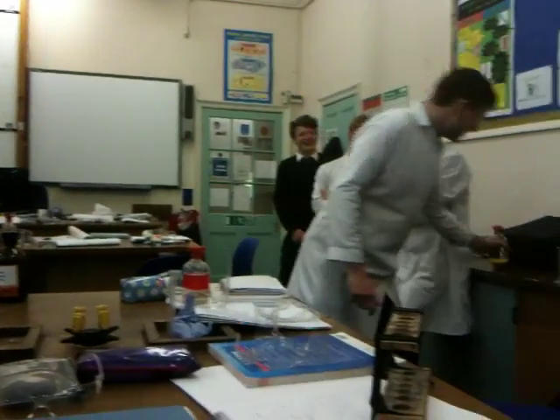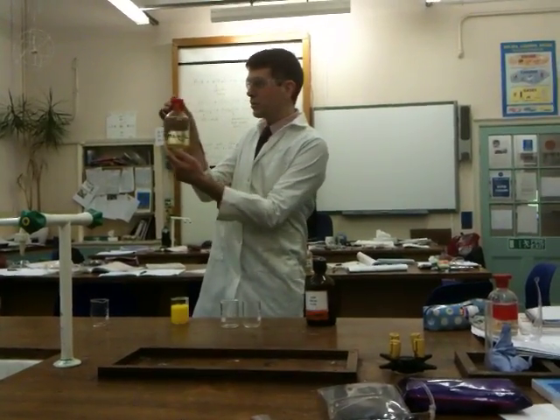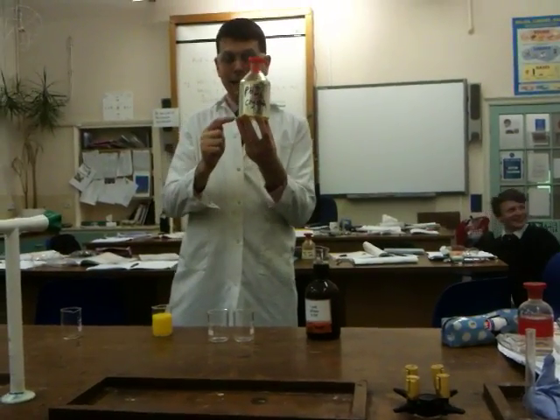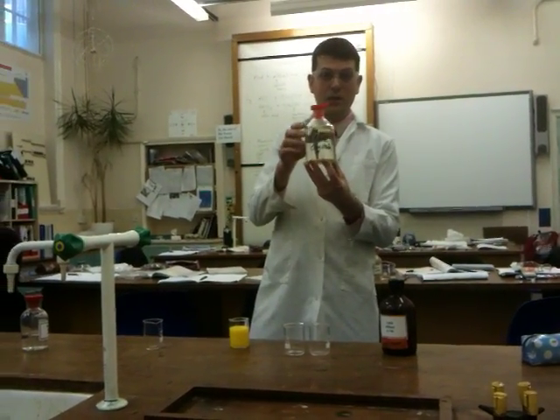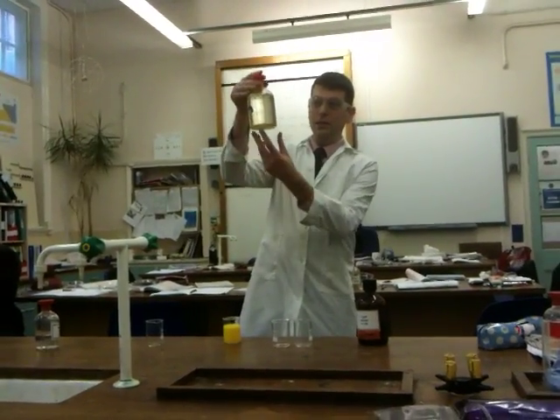So, here we've got some lead iodide. You can see it's now all settled to the bottom. They've joined together and made the insoluble lead iodide crystals. You've still got potassium ions and nitrate ions floating about in the water, but it's lead iodide. You can spot that yellow solid at the bottom.